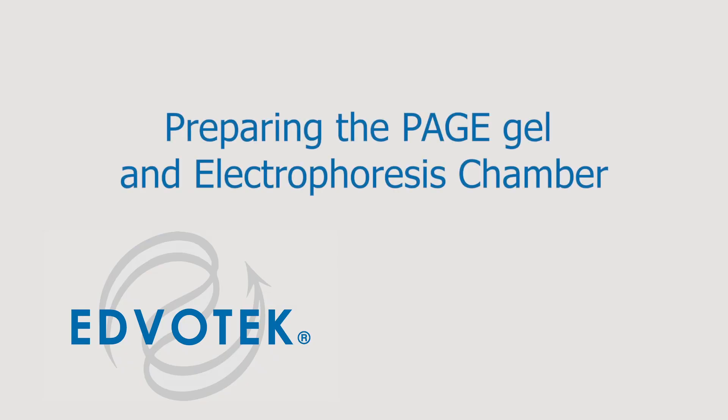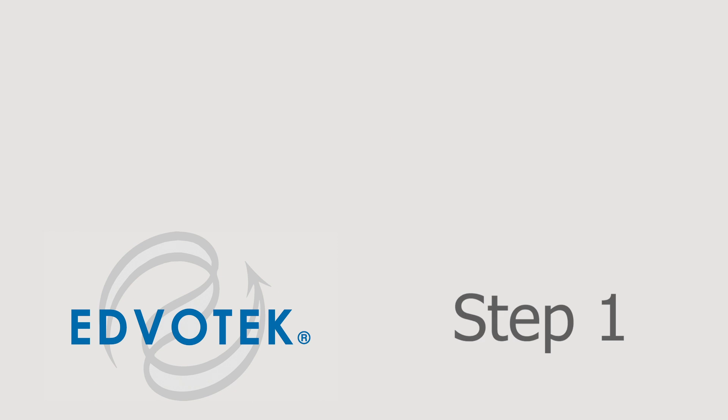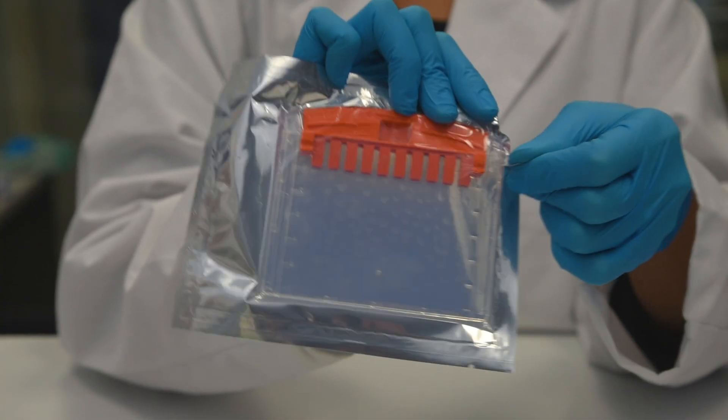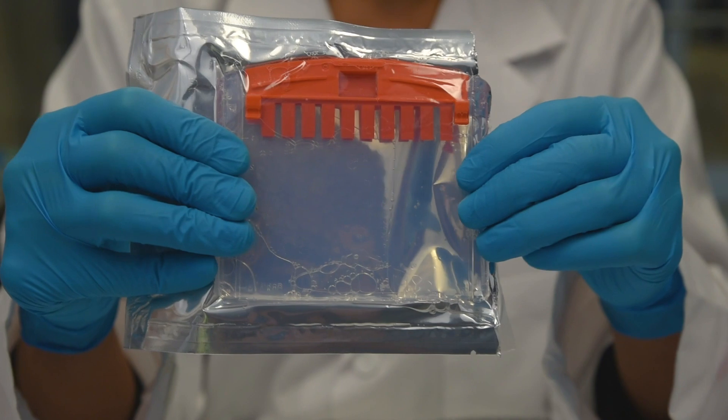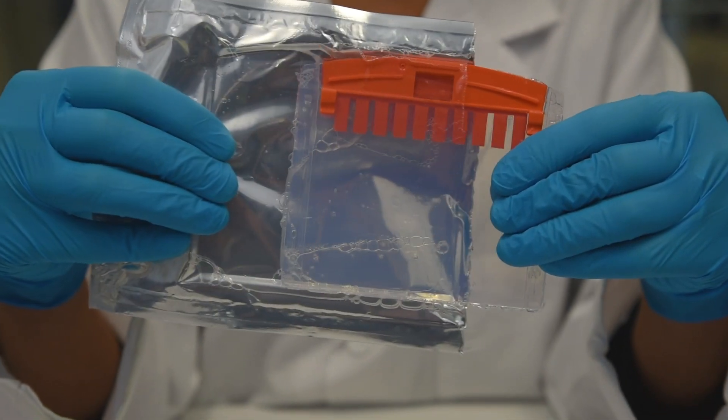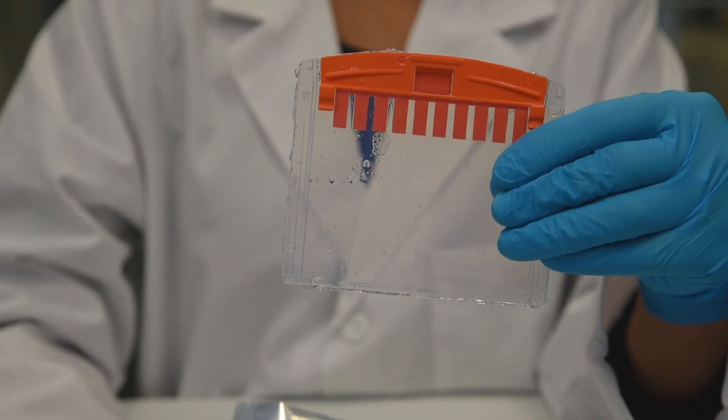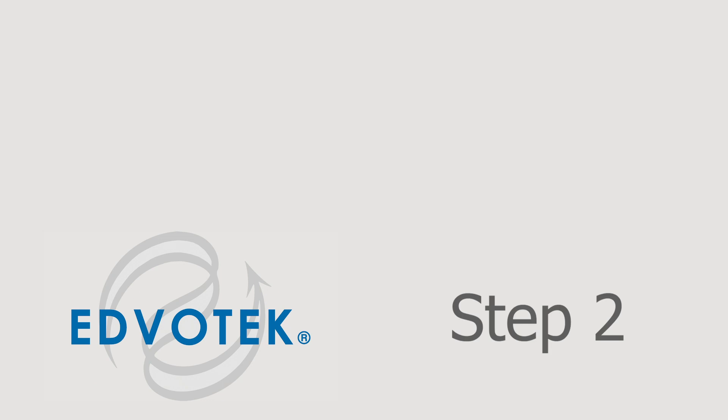Preparing PAGE gel and chamber. Step 1: Open the pouch containing the gel cassette, remove the cassette and place it on the bench with the shorter front plate facing up.